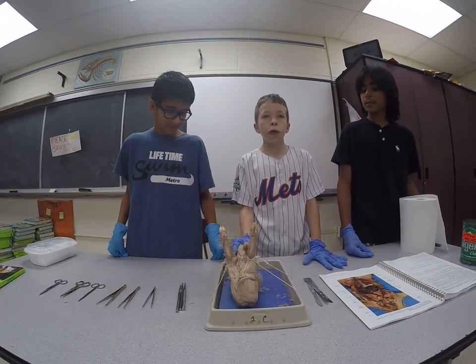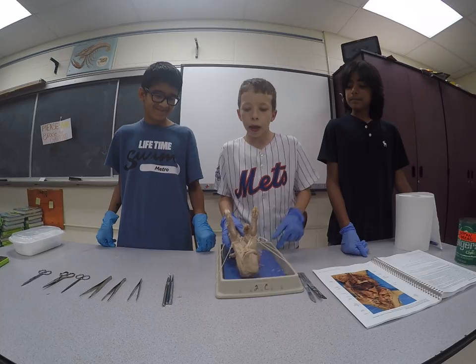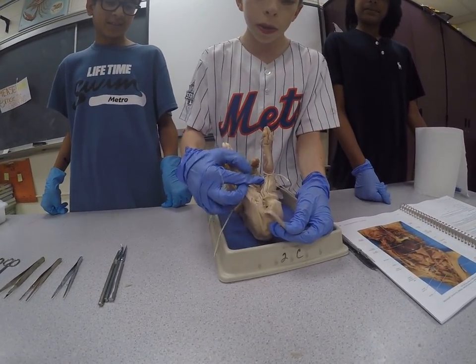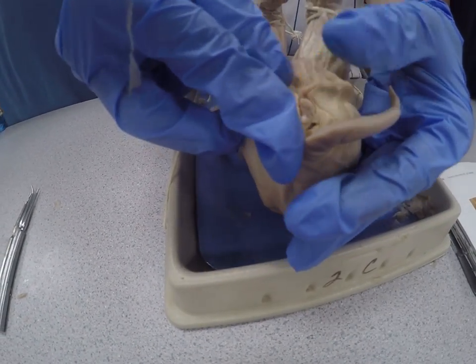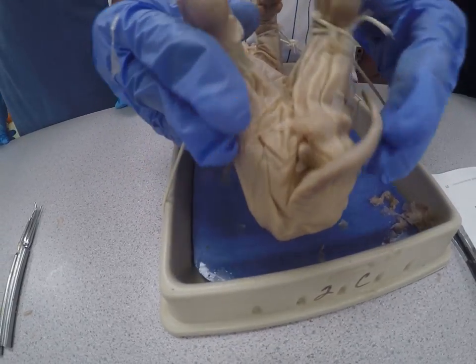Today we will be dissecting a fetal pig. Ishan and Mahir will be helping me. This pig, as you can see by looking under the tail, is a female because there's no scrotal sac holding the male genitalia. There's only an anus and a genitalia papilla, confirming that it is a female pig.